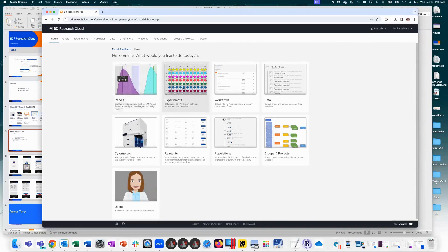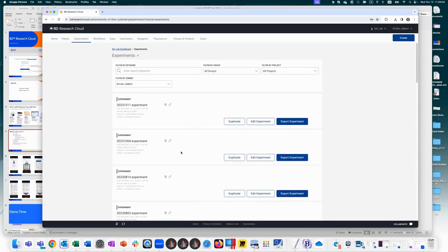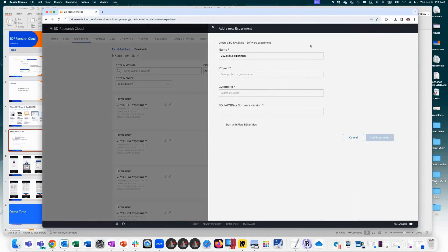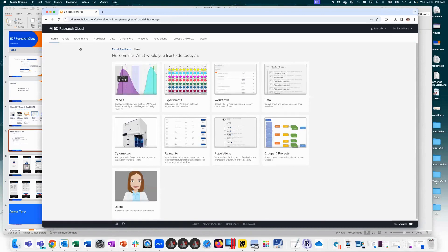In the experiments section, this is where you create FACSDiva experiments. You can view past experiments, edit, duplicate, or create from new. Creating a new experiment guides you through selecting the cytometer, plate layout, identifying cells, pulling in panels, and adjusting voltages. Today I'm focusing on 5.1 details, but I'm happy to explore that more if there are questions.